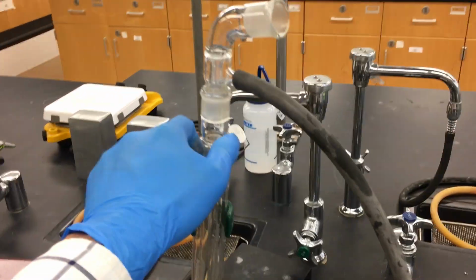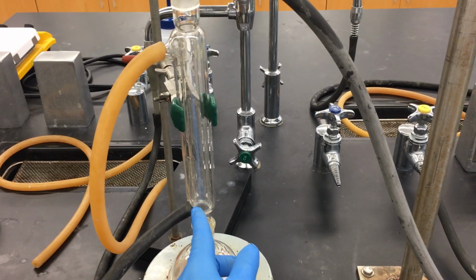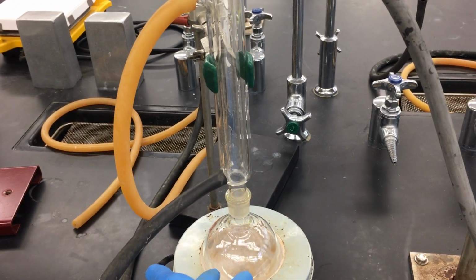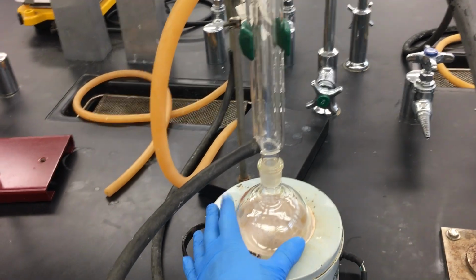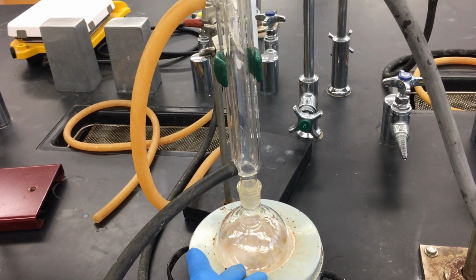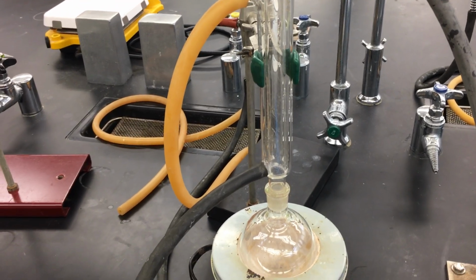Now, as I had told you previously, in a condenser, the water must always flow against gravity. Hence, this time, the bottom hose is where there is water inlet, and it flows against gravity going up and then comes out through the top hose. Our solvent will boil in here, and our reaction solutes, which are going to be hydrobromic acid and butanol mainly, are going to react with each other in an SN2 reaction, and then over time our hydrobromic acid and butanol will go down in concentration, while the concentration of bromobutane will rise.